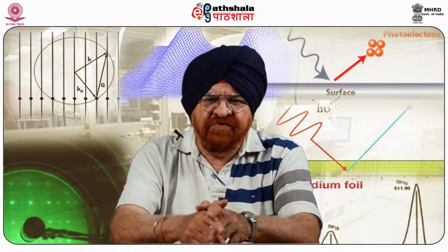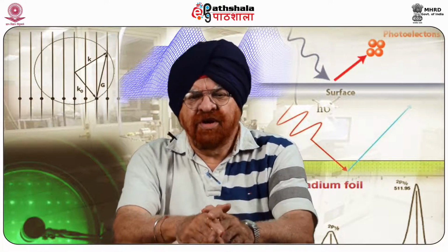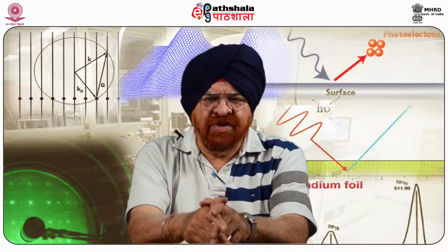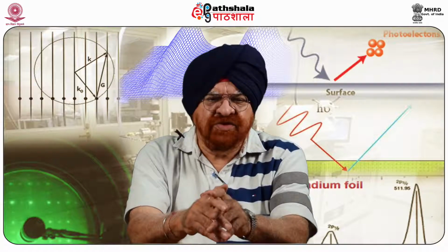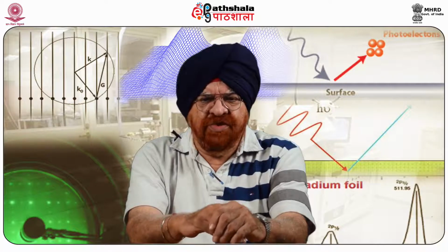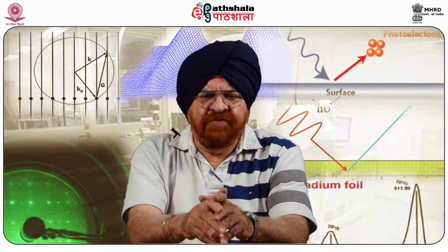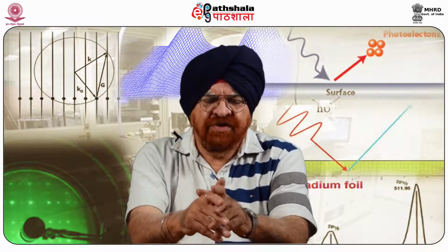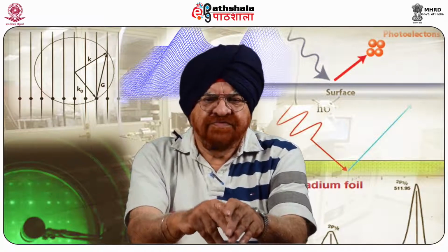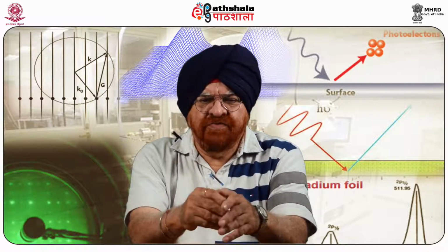The map of the work function produced by KPFM gives information about the composition and electronic state of the local structures on the surface of a solid. KPFM is a scanning probe method where the potential offsets between a probe tip and a surface can be measured using the same principle as a macroscopic Kelvin probe.